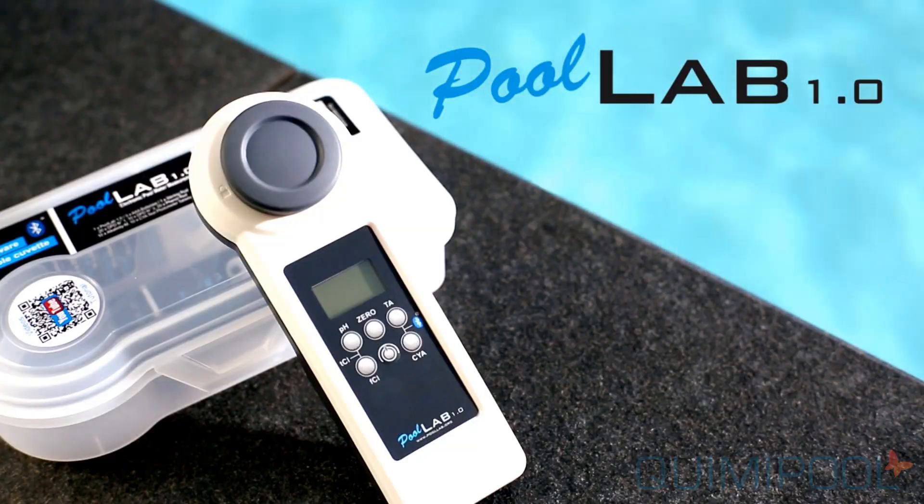The PoolLab is a powerful water testing device for professional and private use.